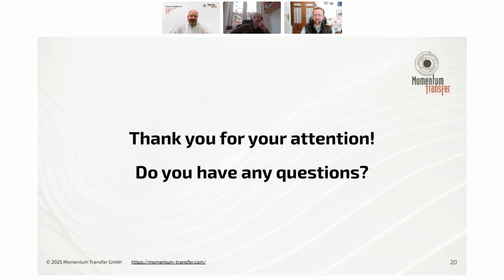We have lots of ideas for things to incorporate in here, and so that we could release something to you guys, we had to choose which ones to include for the beginning. But we absolutely plan to add more filtering capabilities and more search functionality in the near future.